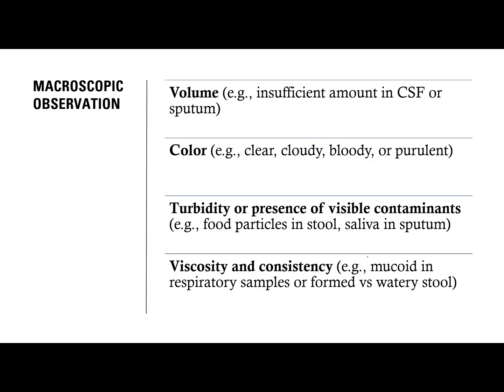Then, when observing the samples, take note of the following: macroscopic and microscopic. For macroscopic class, the volume, is the amount sufficient? Take note of the color, take note of the turbidity or presence of visible contaminant. Then what are the viscosity and consistency? Is it mucoid, salivary, mucosalivary, or formed or watery sa stool?